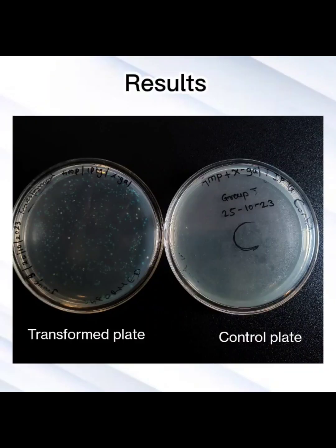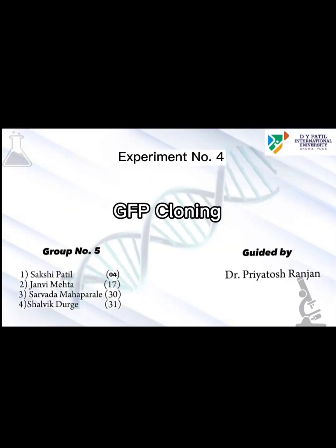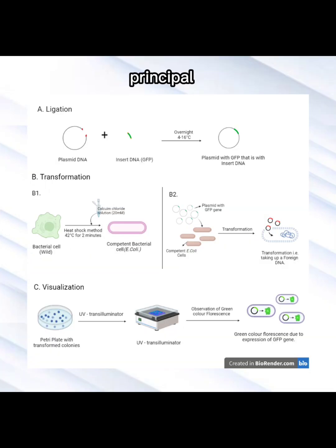Results. In today's video, we will discuss GFP cloning. Cloning is the process of making multiple copies of a particular piece of DNA. So it's mainly based upon three principles: ligation, transformation and visualization. Let's proceed step by step.